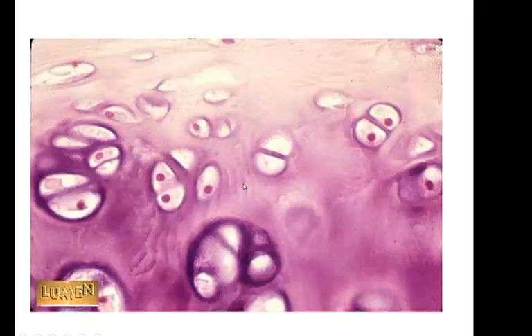Here's another set. Oh, there's some good owl eyes right there. They look like owls. Don't they look like owl eyes peeking out at you? Now this is hyaline cartilage. It's not as smooth in the background, but when we get to the other cartilages, you'll see that this is relatively smooth. And here's another hyaline cartilage. Relatively smooth in the background. As smooth as it can go. Looks like 1970s wallpaper to me.